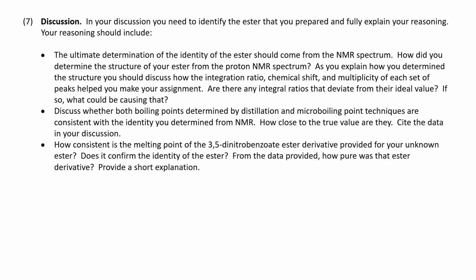So then the final part of the report is a discussion. In the discussion, what you need to do is first of all identify the ester. I didn't say this.